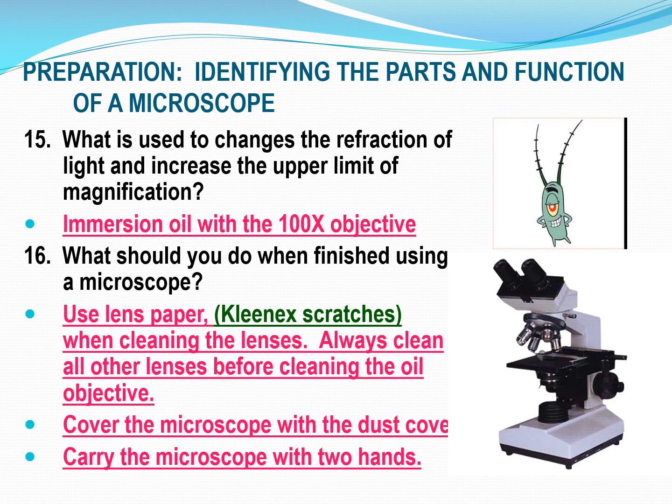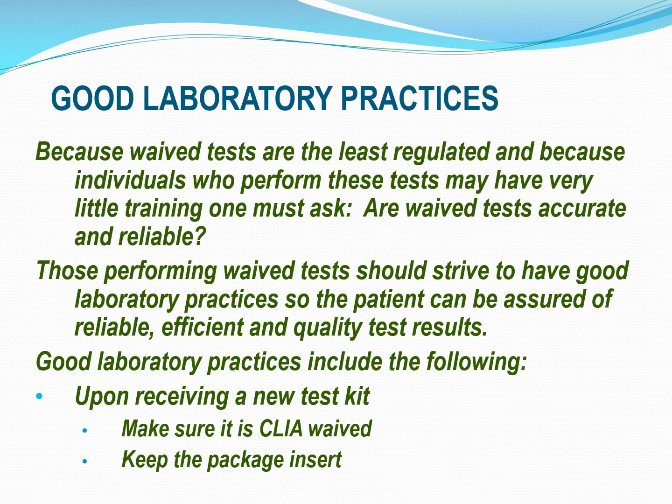And then you cover your microscope with a dust cover, carry the microscope with two hands, one being on the arm and one being under the bottom of the base. Okay, and then when we're in lab, you will be shown where it is stored, okay?